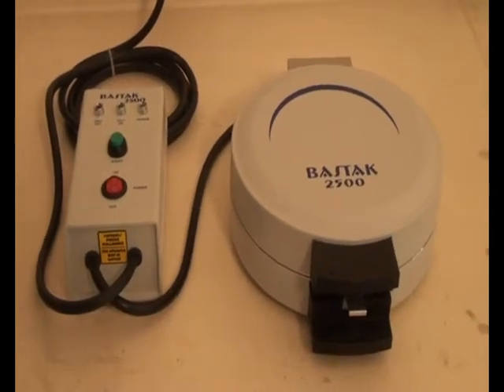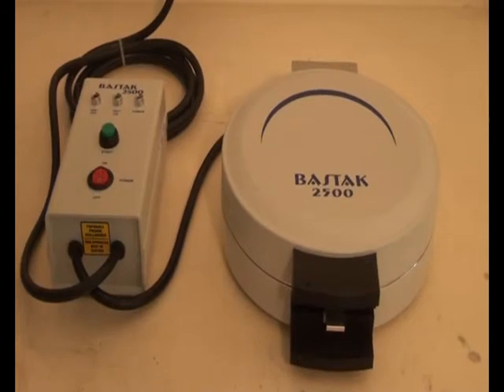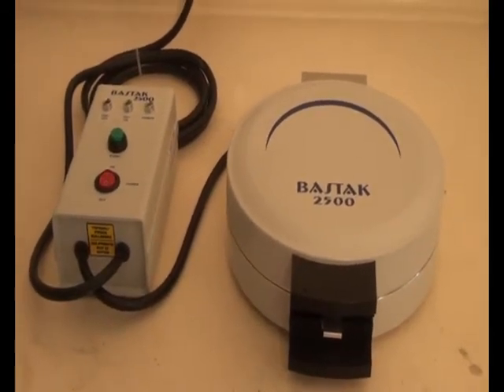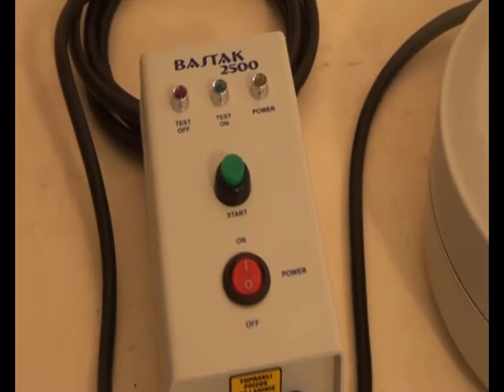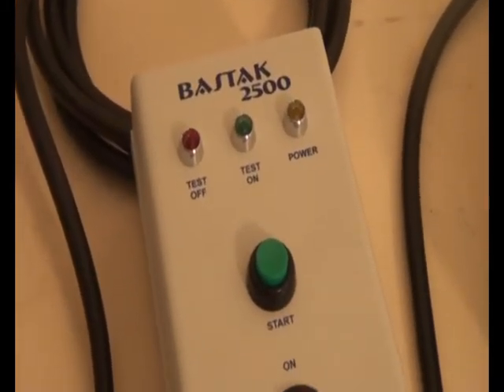The Bastak 2500 model dry gluten instrument is used to determine the exact dry gluten amount in flour or whole meal. The control panel has a power button, start button, and three warning lights: power, test on, and test off.